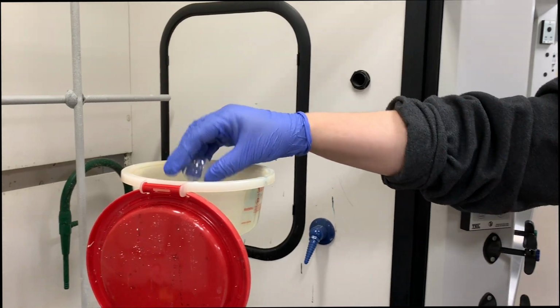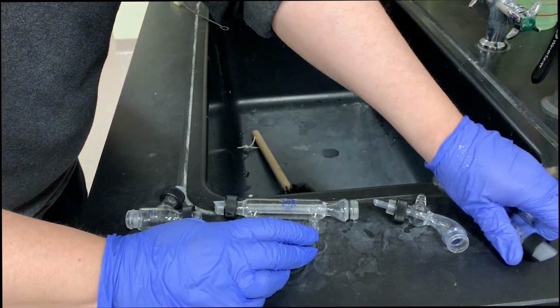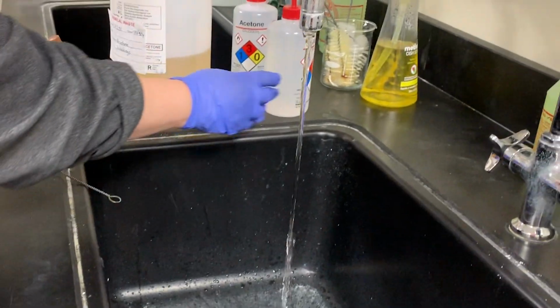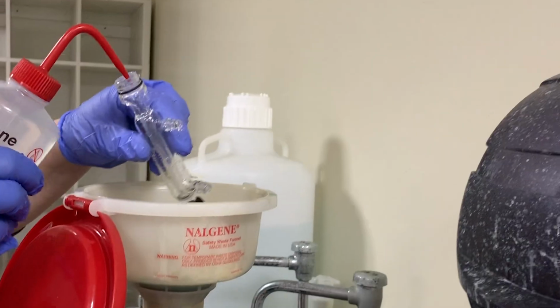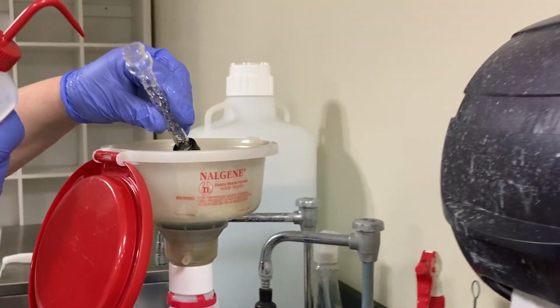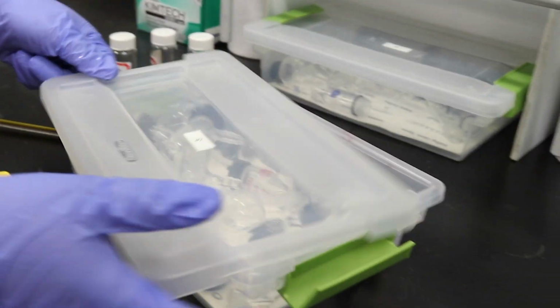We're going to also dispose of any liquid in our waste jar, and then we're going to take the glassware over to the sink, and we're going to wash out our glassware. And once our glassware is clean, we can rinse it with a little acetone, making sure the acetone goes into the acetone waste jar. We can rinse out and clean our glassware and put our glassware back in our microscale kit, cap it, and put the microscale kit away.